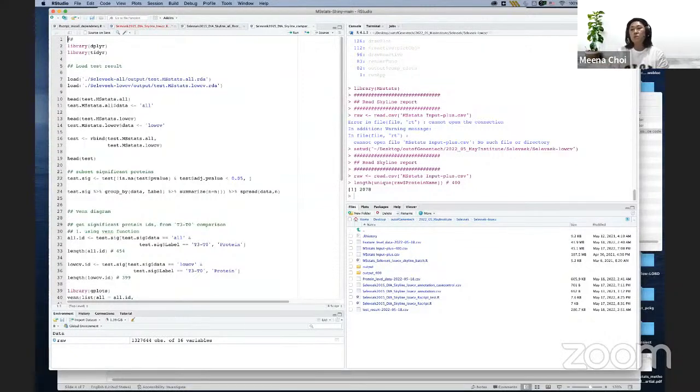But the normalizations we are proposing, especially equalize medians and quantile normalization, have an assumption: we have a larger number of samples, and the majority of the intensities should be equal. The majority should not change across the samples. Based on this assumption, we can do it. For the IP case, this assumption is not suitable anymore, so we should not use these normalizations.